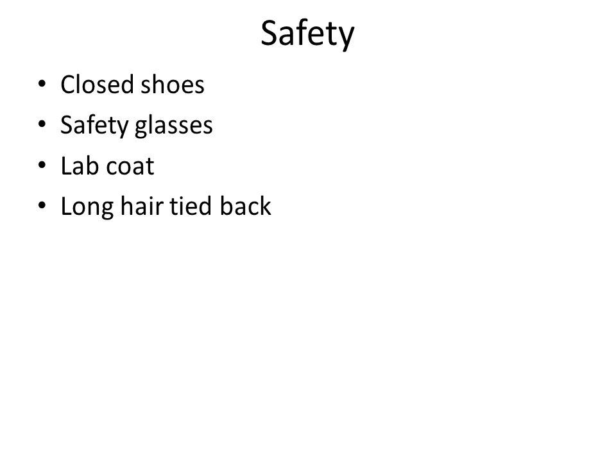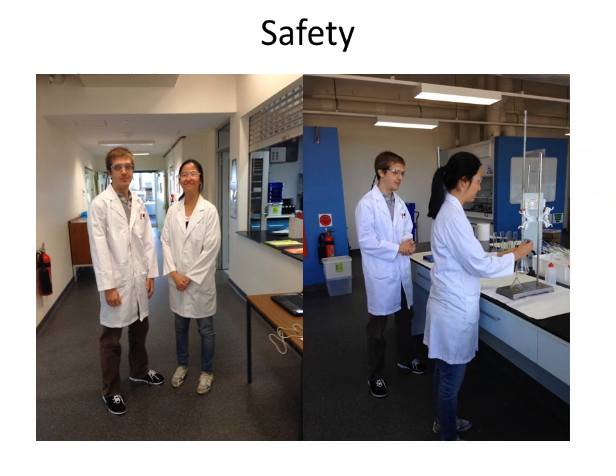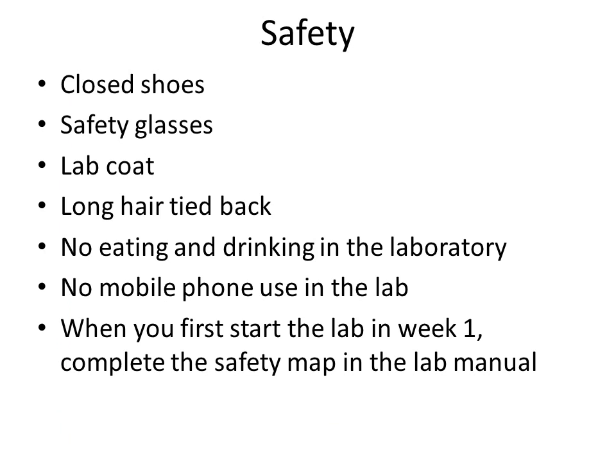It's essential that you think about and work safely whenever you're in the lab. You must be wearing closed shoes, safety glasses, a lab coat, and have long hair tied back at all times. Whenever you step out of the lab, even if it's just to go to the toilet, you must take off your lab coat. You're not allowed to wear a lab coat anywhere in the common areas of the building. As usual, there should be no eating or drinking in the laboratory, and you are not permitted to use your mobile phones when you're in the lab. If you absolutely must take a call, please just step outside.